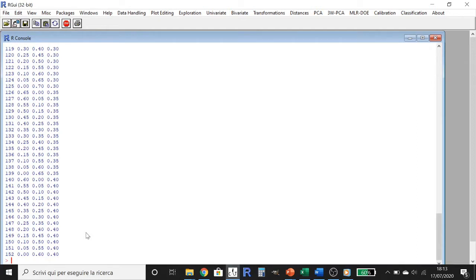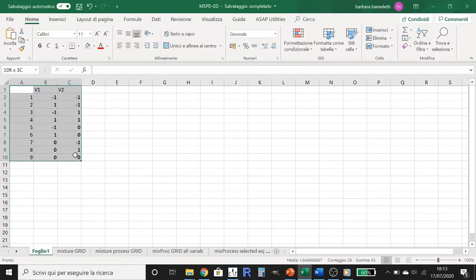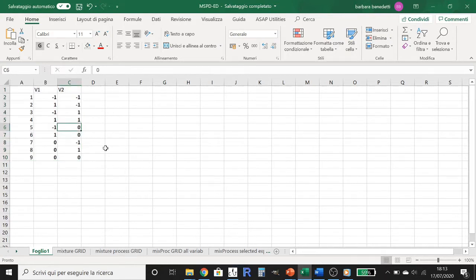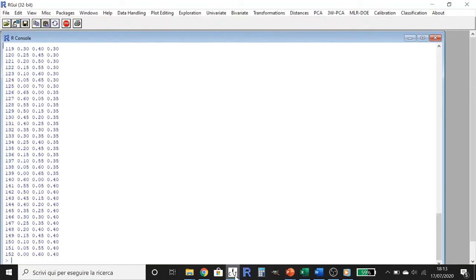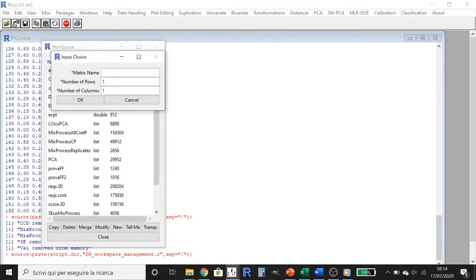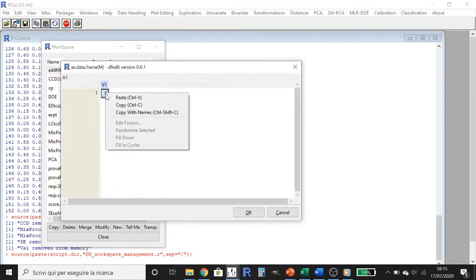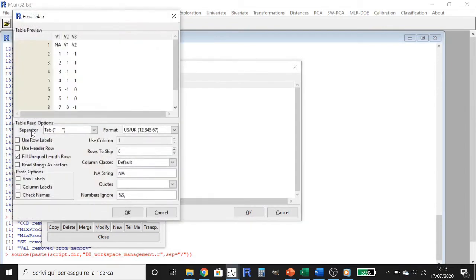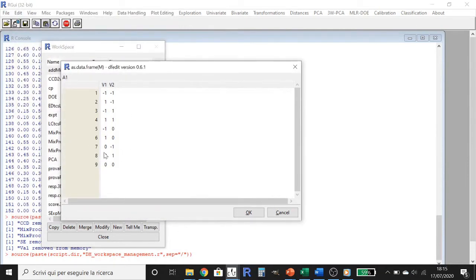Then we need to multiply this grid by the central composite design points. We go to Excel, where I wrote the simple central composite design matrix for two factors with an alpha value equal to 1. We copy this matrix, go back to the software, go to Data Handling, Workspace Management, New, and call it CCD. We select the cell, right-click, paste, use row label and use other row. We now have our matrix for the central composite design experiments with process variables named V1 and V2.